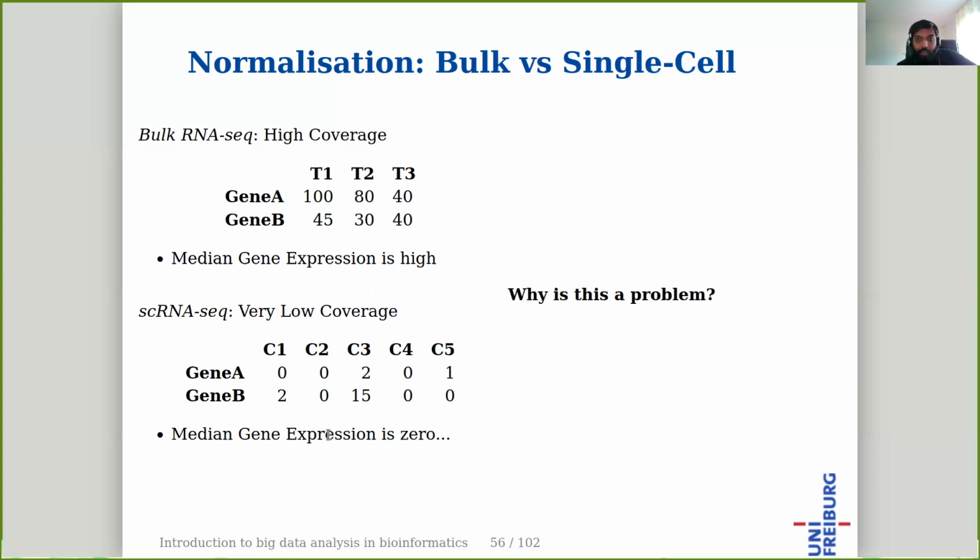Why is that important? Because if you recall the DESeq normalization, what we take first is this denominator, which is a geometric mean among all the counts here. So take the geometric mean from this, and then divide each count by this geometric mean, and that's what we do.